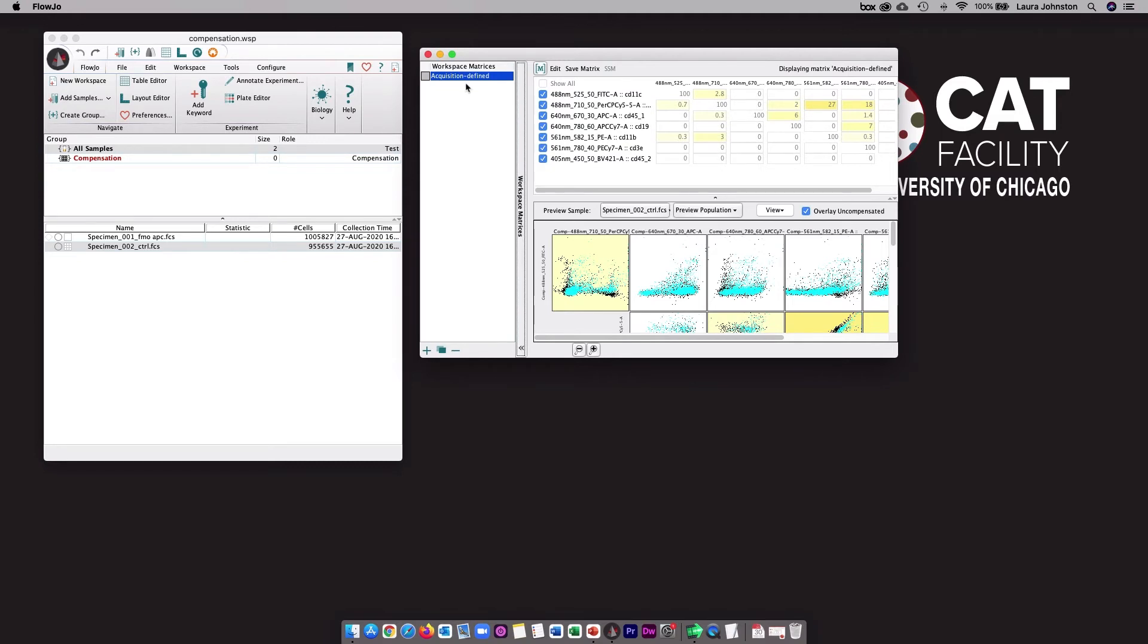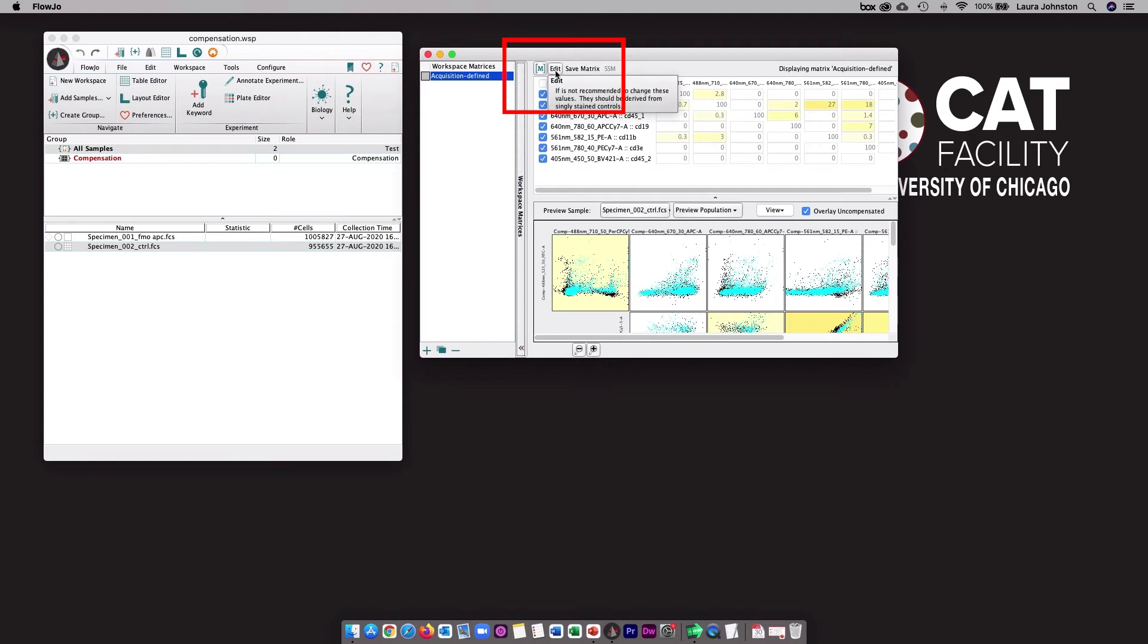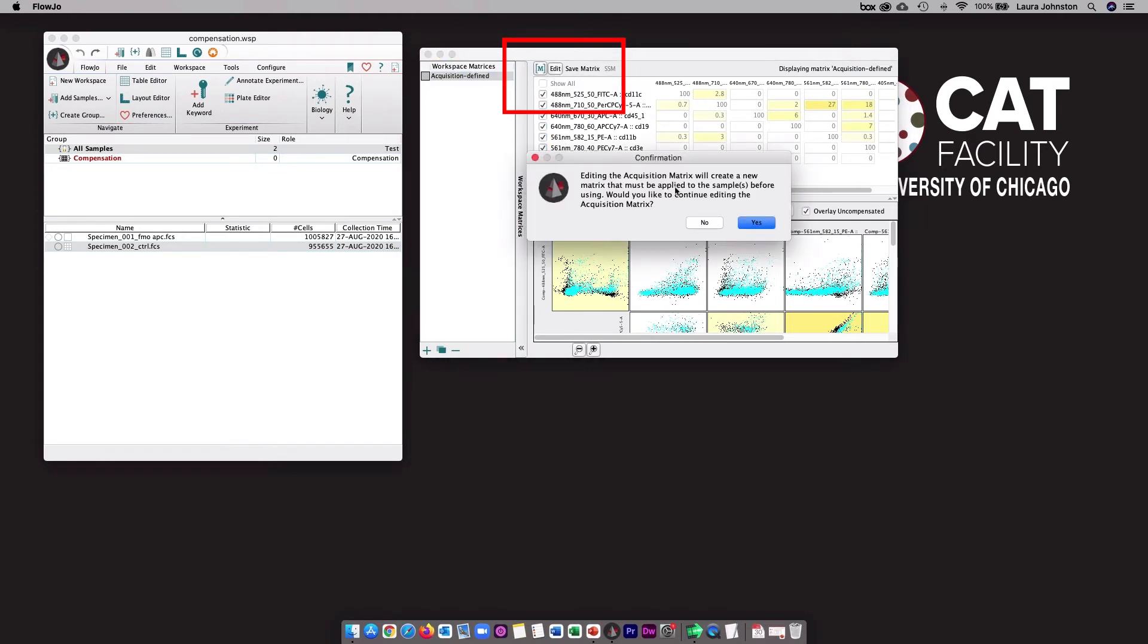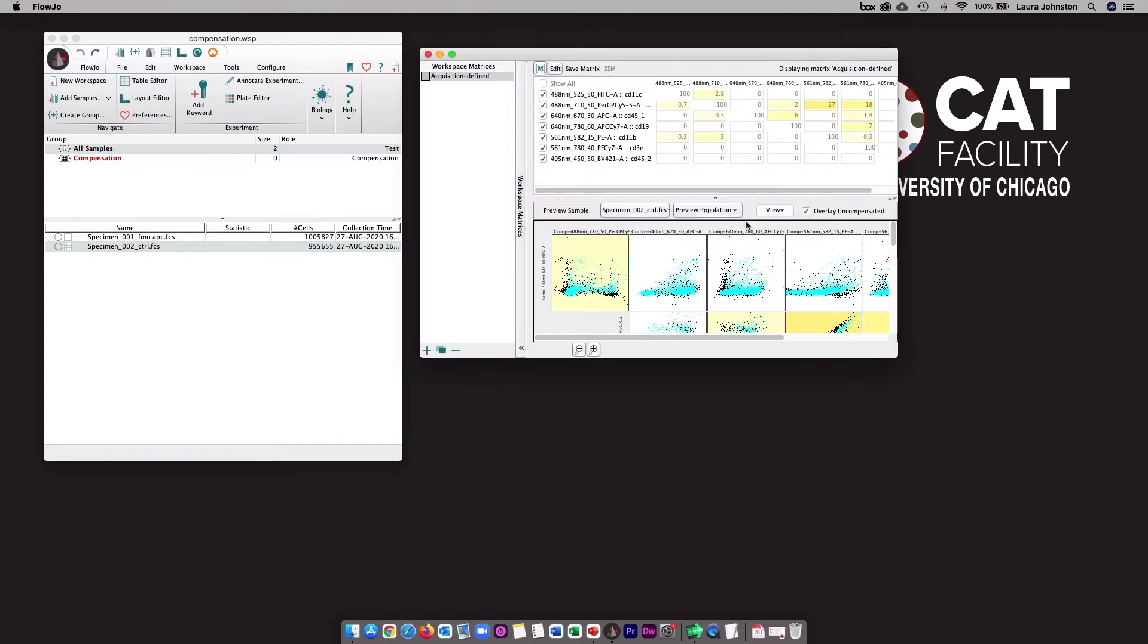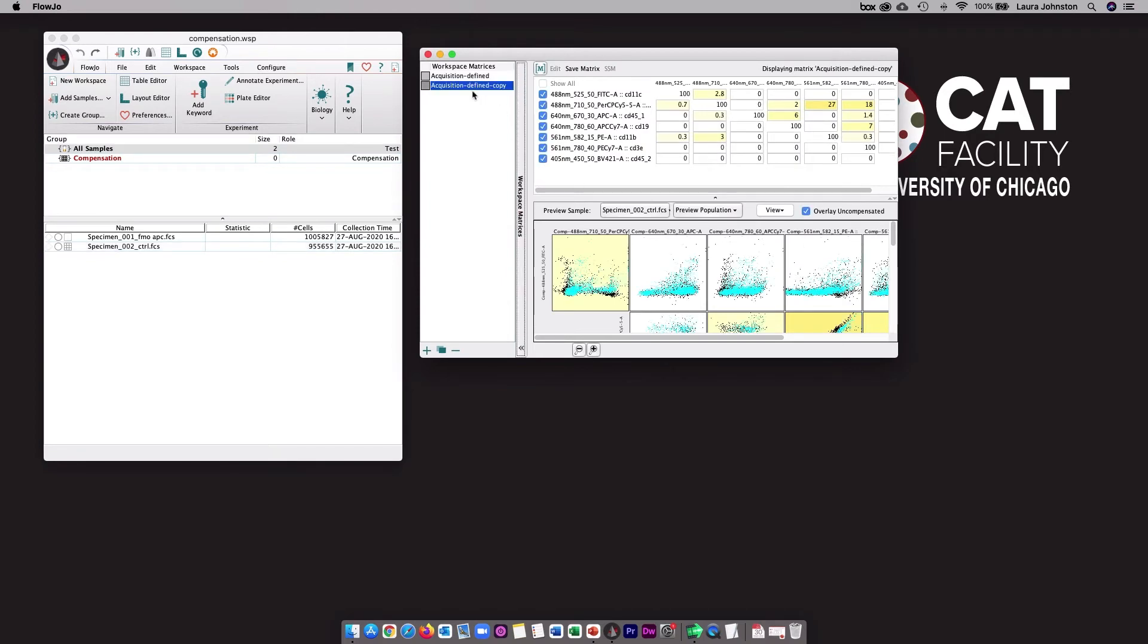Now the first option is to manually modify the acquisition-defined matrix. When you click this edit button here, it will ask if you want to create a new one. I'll say yes. This will duplicate the acquisition-defined matrix, and now you can enter any values into the matrix yourself as is appropriate for the experiment.